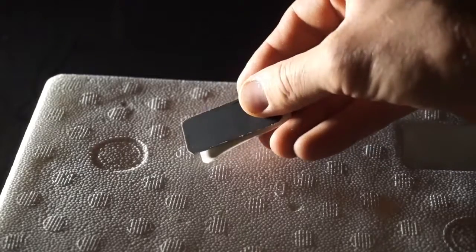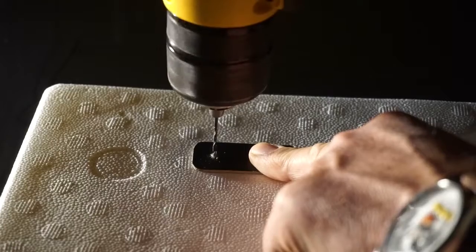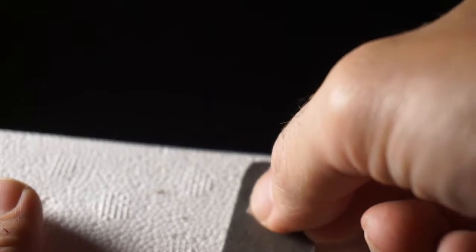The next step is take your paper, one piece thin, one thick. Line them up, drill a hole. A common 1/8 inch drill bit works fine here. Tape the lollipop of glass so that the lens is over the hole on the thick piece of paper.